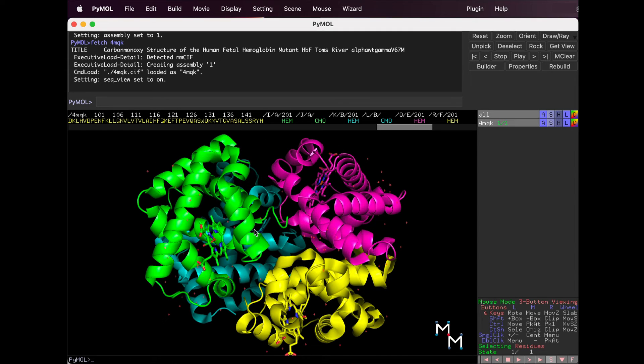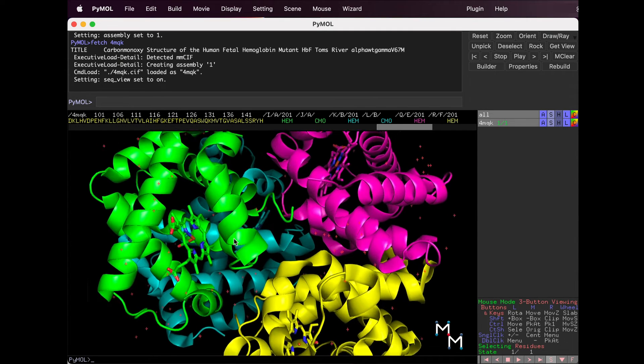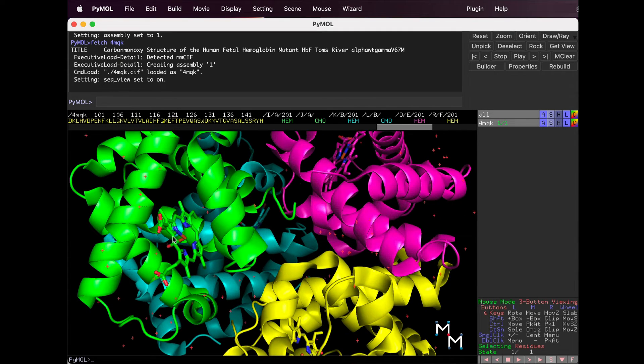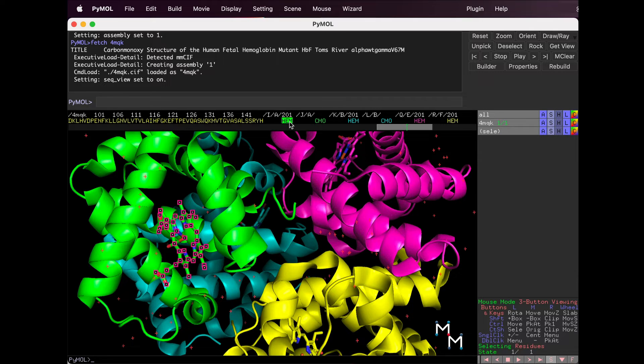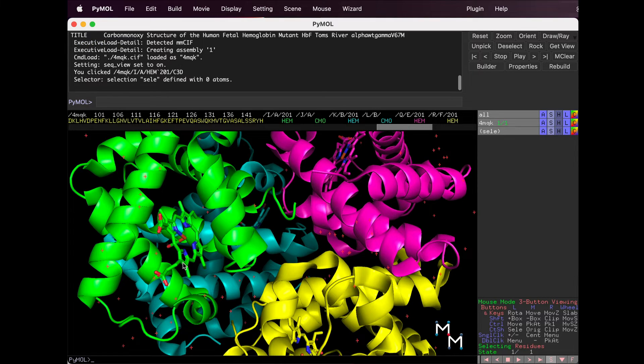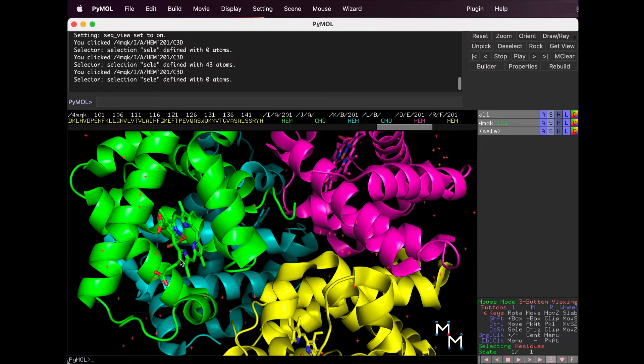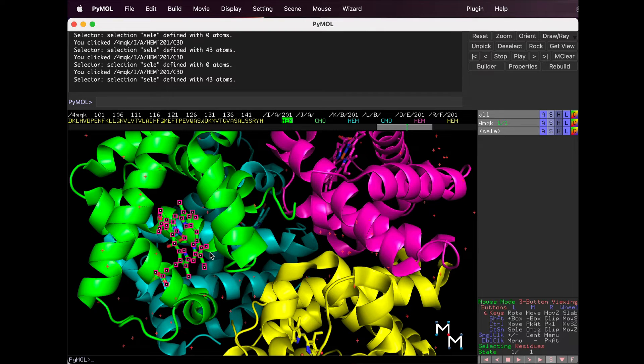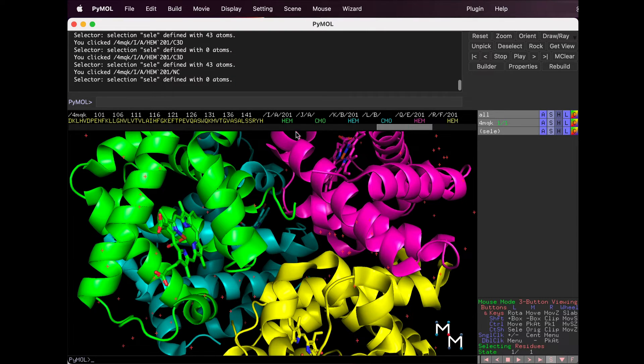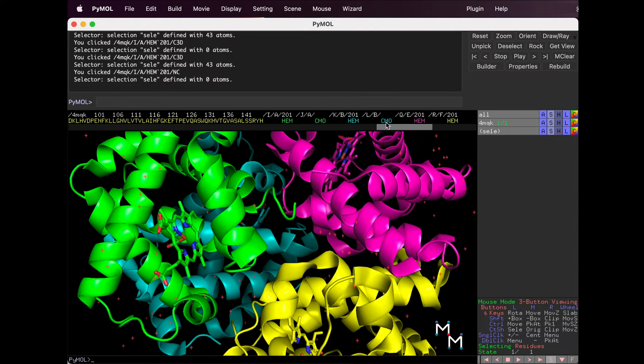We can select one of the hemes by clicking on it in the sequence here, or on the structure itself in the structure viewer. There's also CMO.